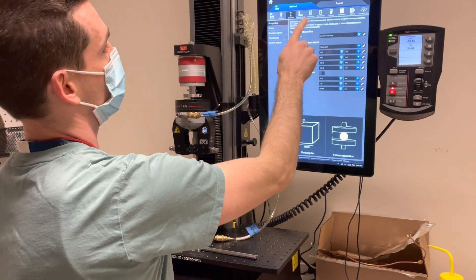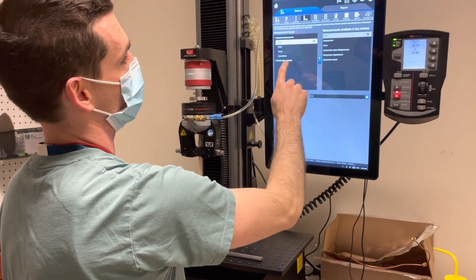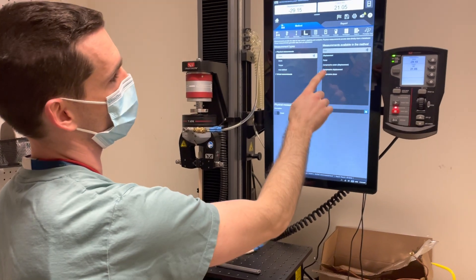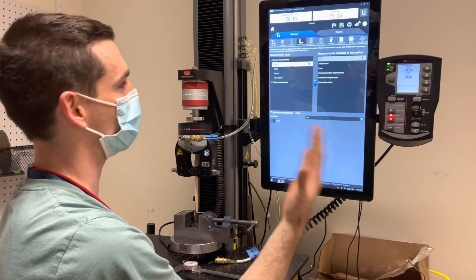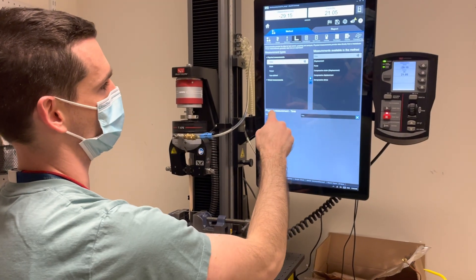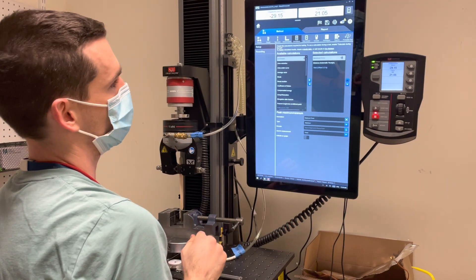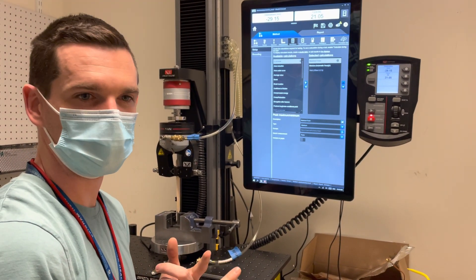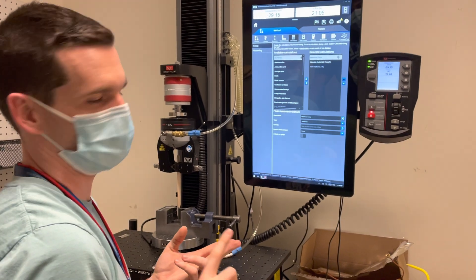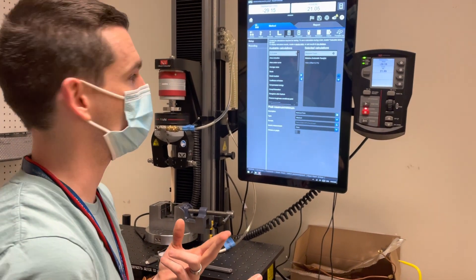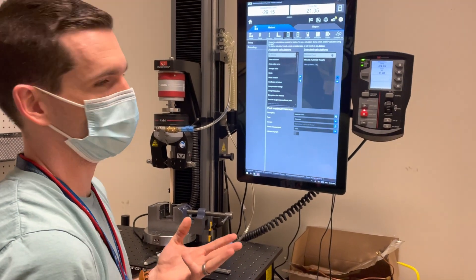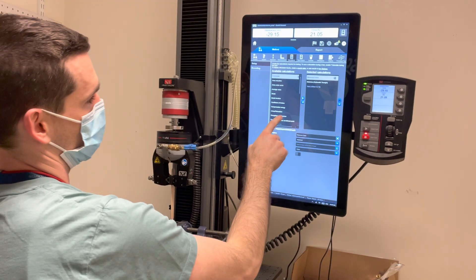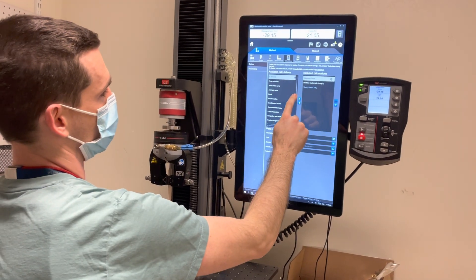For the next thing, you would go to measurements here. Basically the only things you need to know are time, displacement, and force — you can calculate everything else based on that. For your calculations, you may want to know the peak stress or peak load, Young's modulus or stiffness, or the yield point — when the material starts to plastically deform. Those are all in this list.